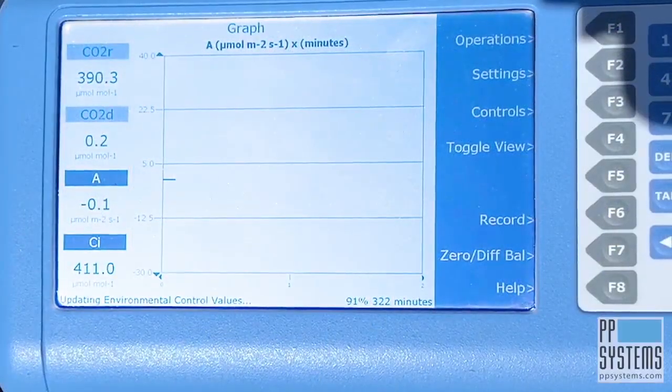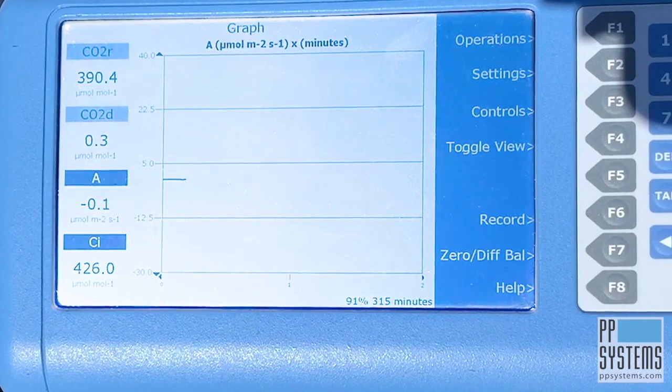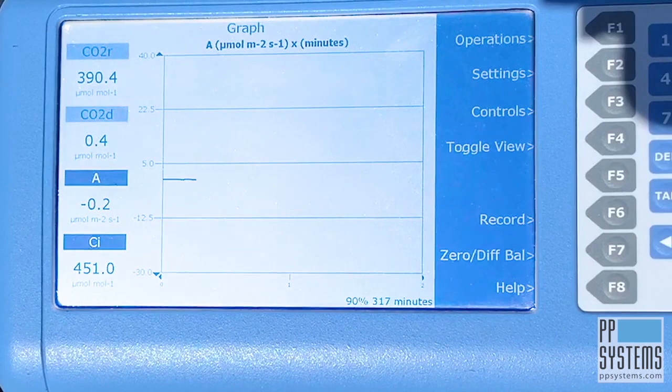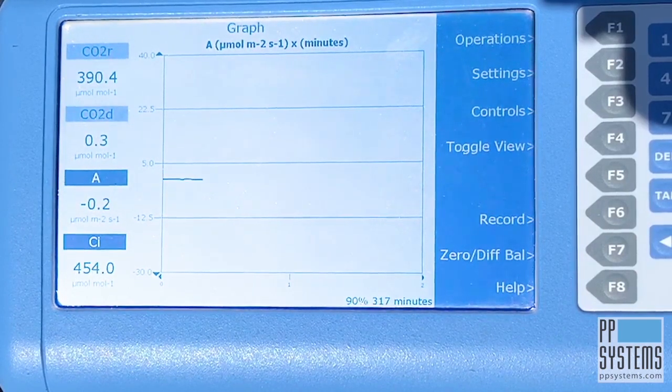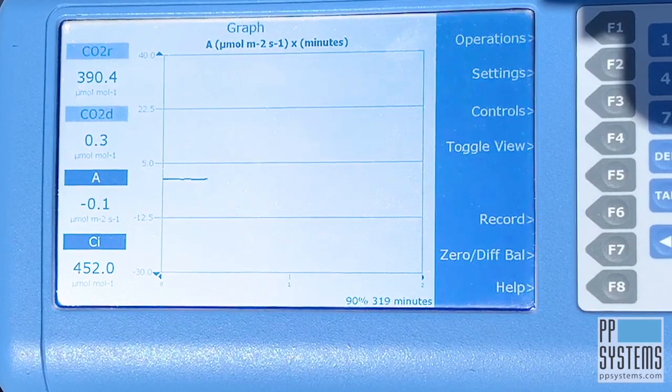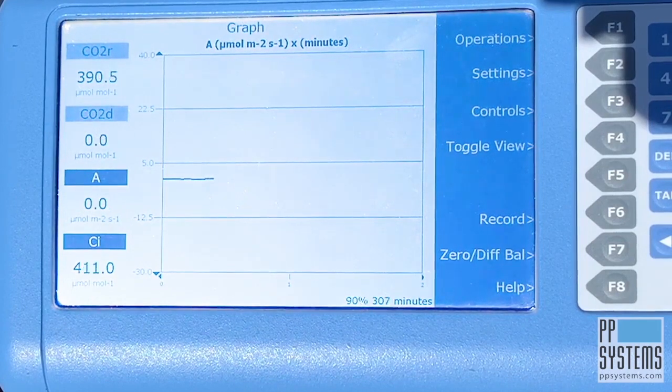Not only is the Cyrus 3 lightweight and compact, its small system volume is optimized for the fastest, most accurate measurement of photosynthesis available, allowing you to perform measurements in just seconds. Faster measurements allow the user to expand the parameters of their research and use their time and resources efficiently.